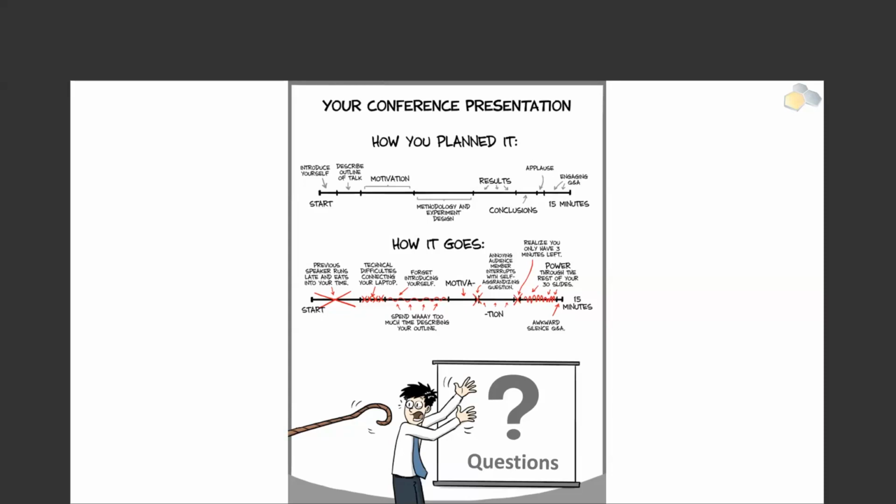In this case, given the rather small number of parameters, we were able to examine the behavior of the algorithm by changing most of them, I think all of them. And we were able to detect the limits of sensitivity and accuracy when we change, for example, the length of the overlap or the minimum length of the split read, and the alignment score of the overlapping regions.